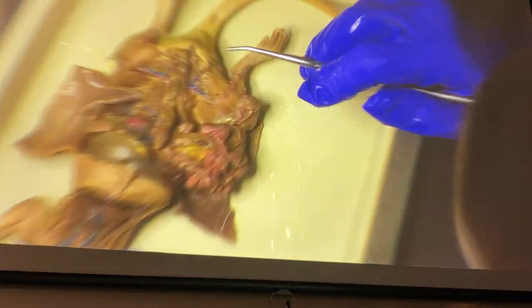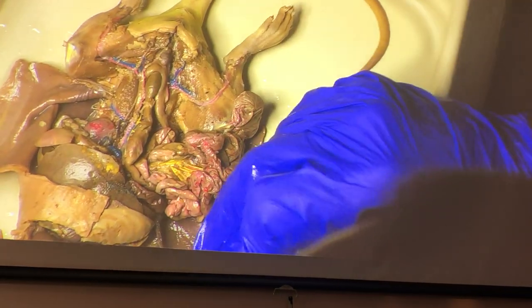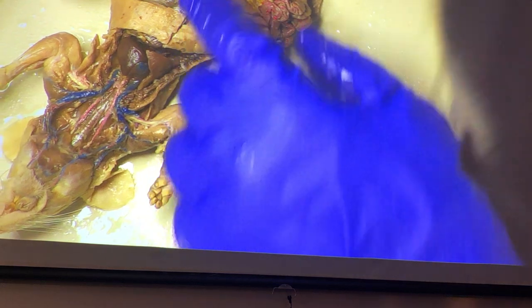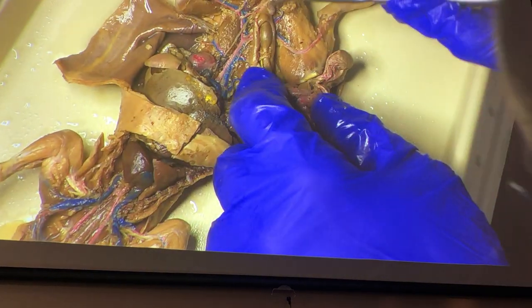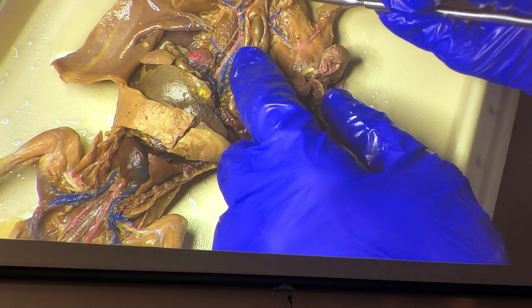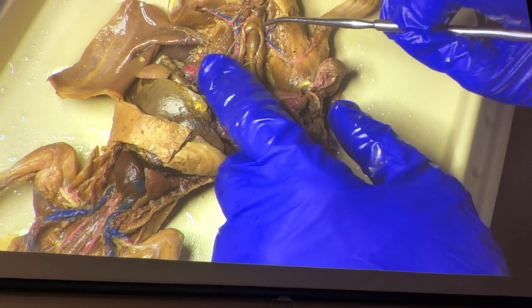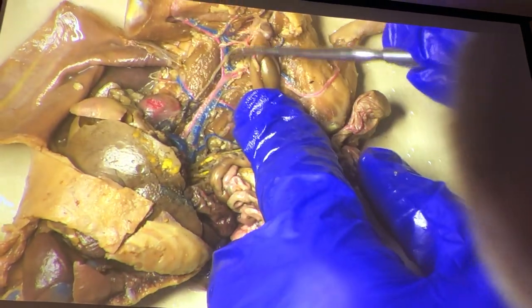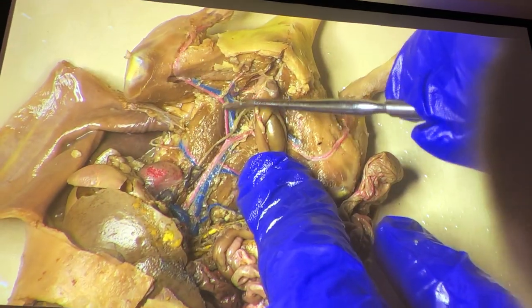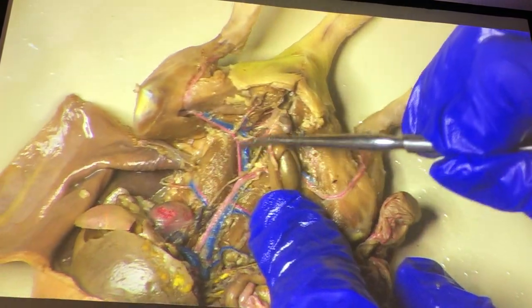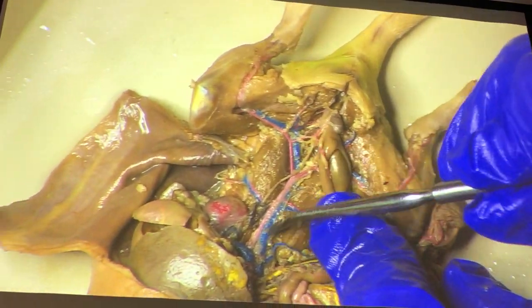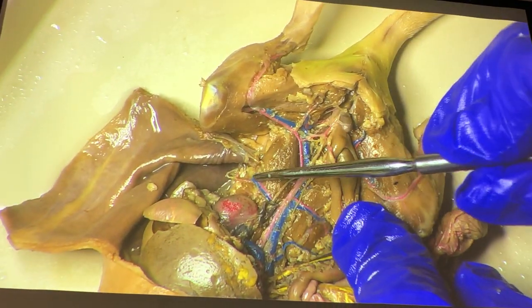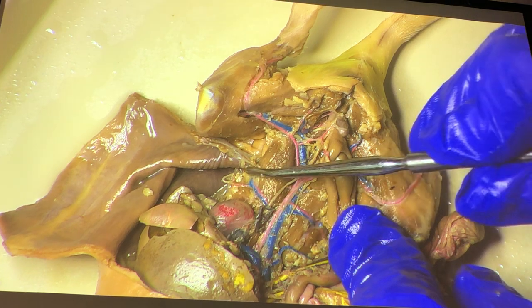Here we see our little girl, and because we can crack the pelvis on this we can see a few more things that we couldn't see with the male. Here we see nicely injected veins down here: post-cava, iliolumbars.